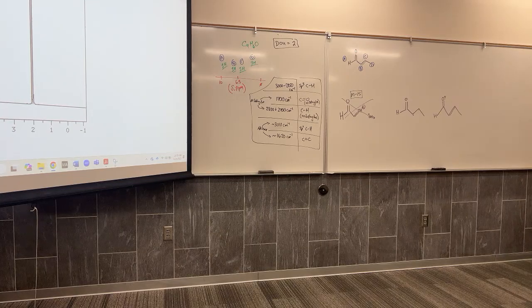Do you remember yesterday when we were talking about NMR splitting patterns and I said, don't try to use NMR splitting patterns for alkenes or aromatic rings? They just get way more complicated than you'd think. In fact, I truly believe that splitting patterns, for the purposes of our class, are some of the least useful information. If you have a small molecule, you can usually figure out what's correct by the integrations and stuff like that.